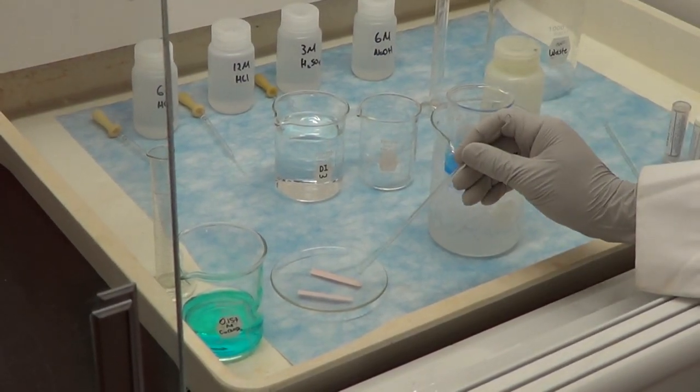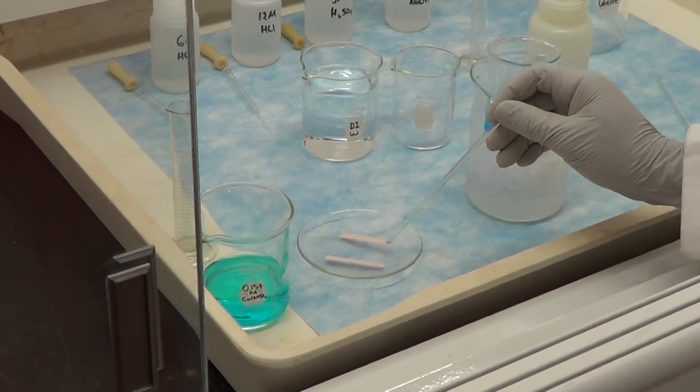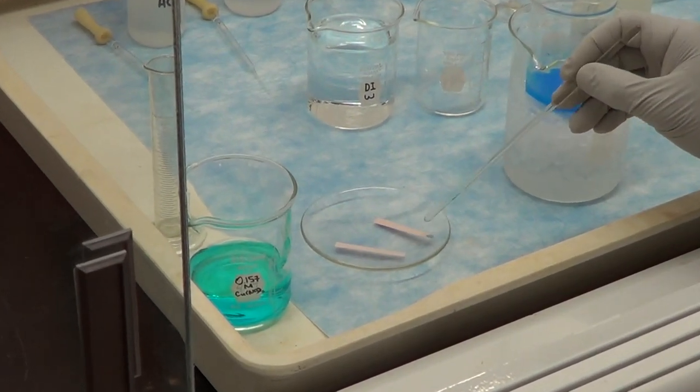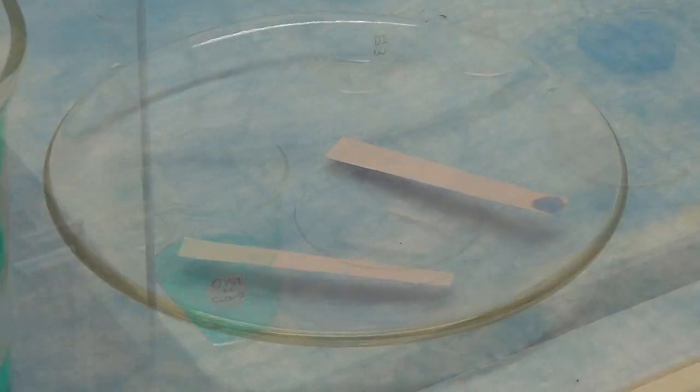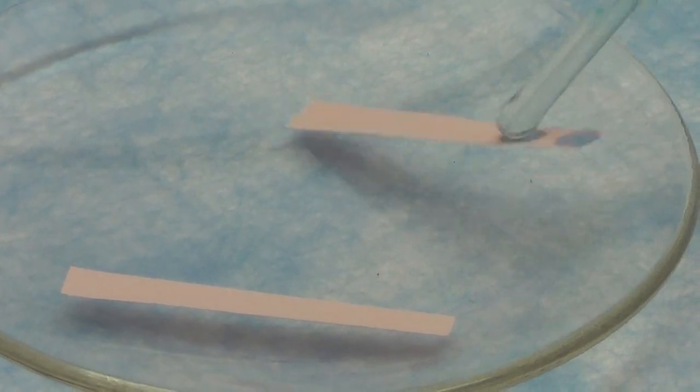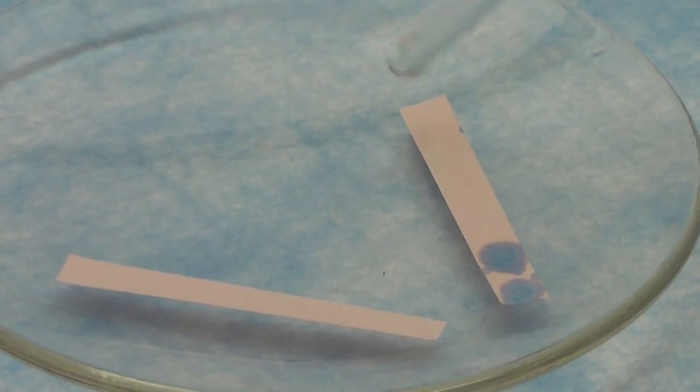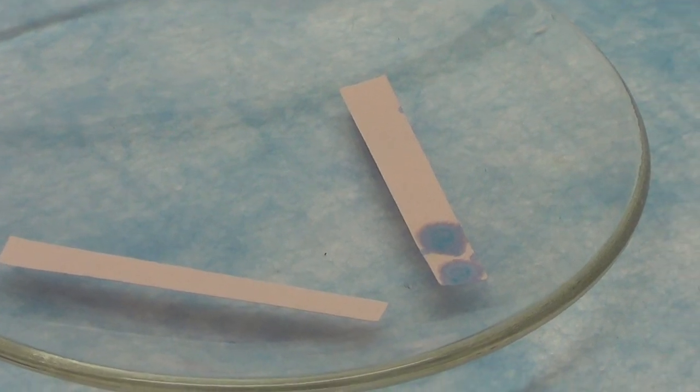We will then use the glass rod to touch the supernatant liquid and then touch the litmus paper to confirm the basicity of the supernatant liquid. The red litmus paper turns blue which confirms the basicity of the supernatant liquid and the completion of the precipitation reaction.